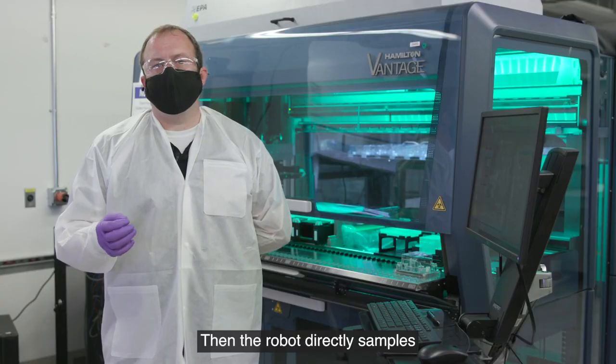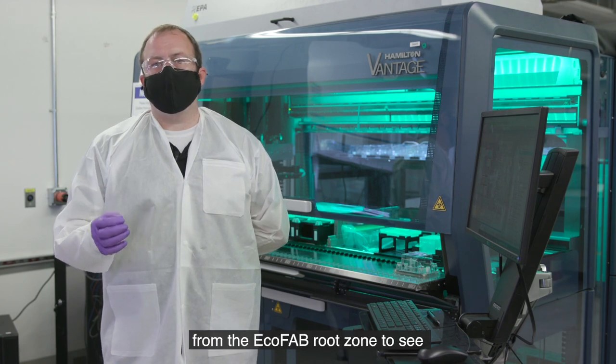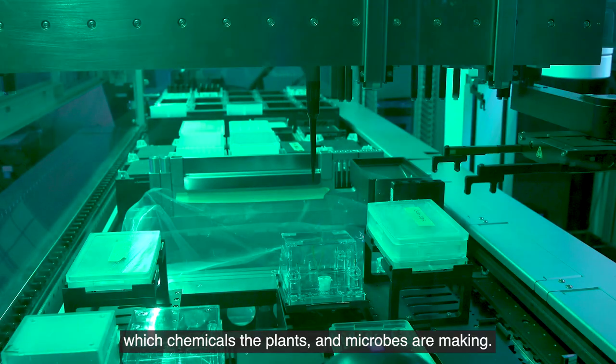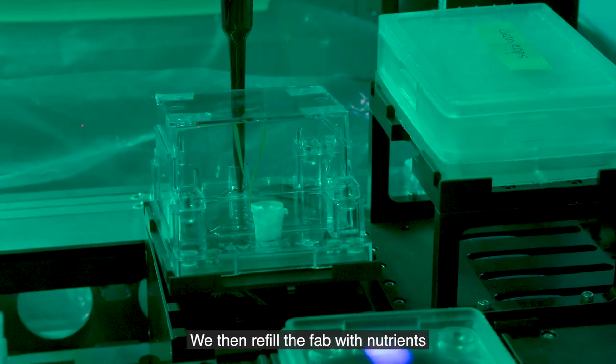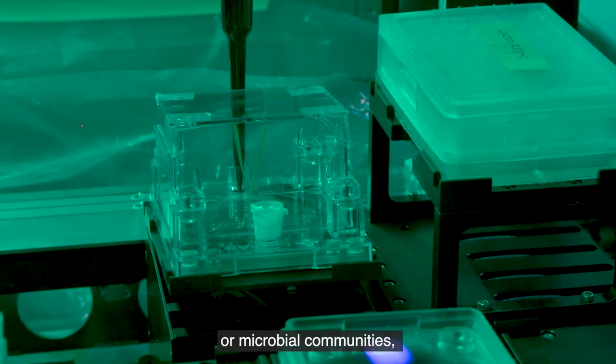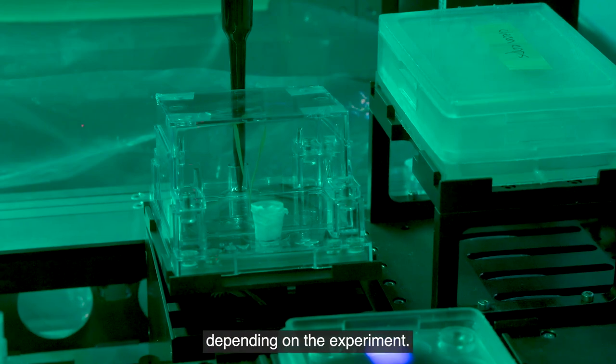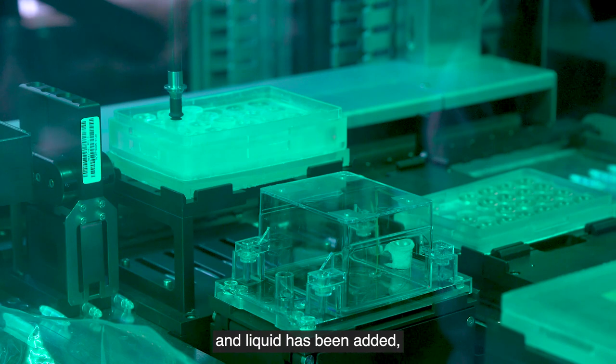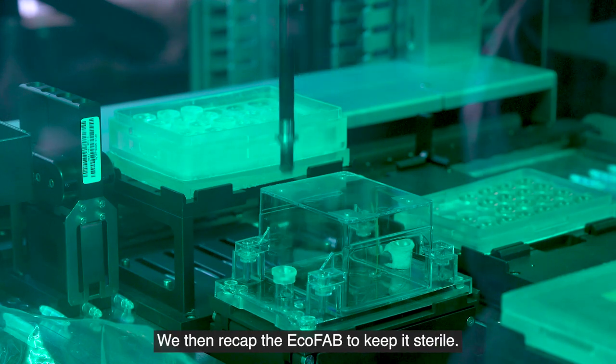Then the ECOBOT directly samples from the ECOFAB root zone to see which chemicals the plants and microbes are making. We then refill the ECOFAB with nutrients or microbial communities depending on the experiment. Once the sample has been removed and liquid has been added, we recap the ECOFAB to keep it sterile.